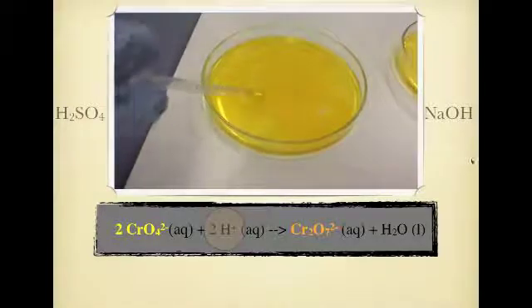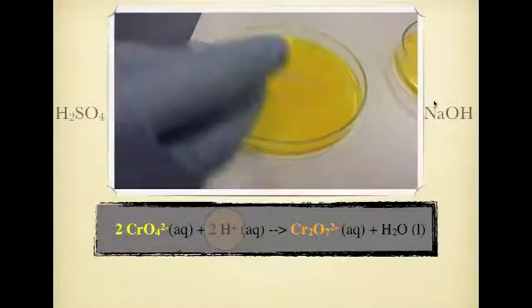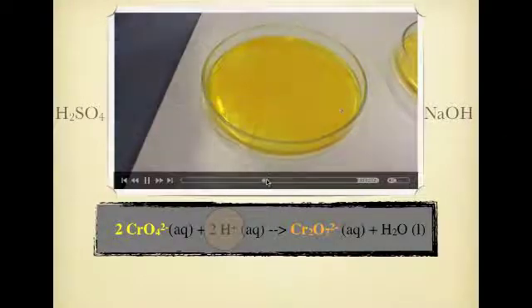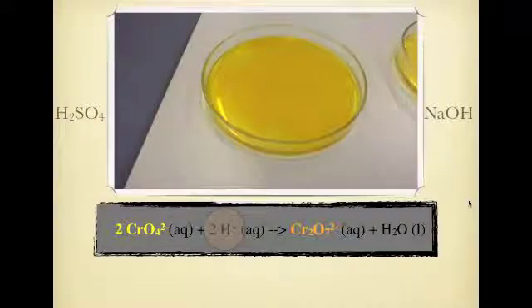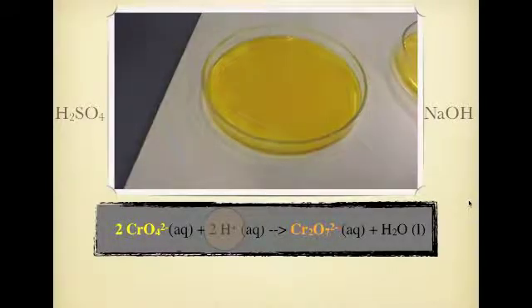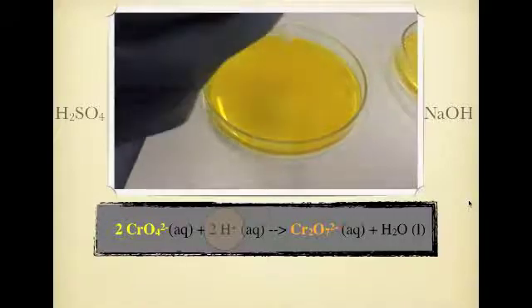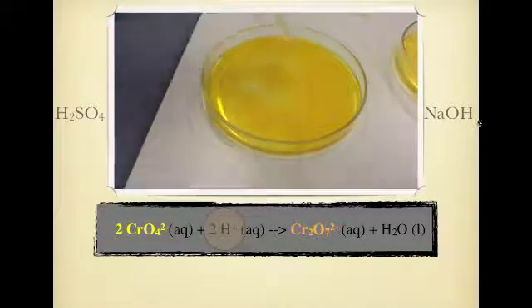The next thing we're going to do is add in some sodium hydroxide, and we're going to have a look at what effect this has on the color, so I might just skip forward a little bit. I won't skip forward, I'll just let it go. Obviously I've done this demonstration in class and now I'm just commenting over top of it. So addition of sodium hydroxide, what happens? Here I go, getting the dropper out, bringing it over and squirting it in. All right, adding sodium hydroxide.